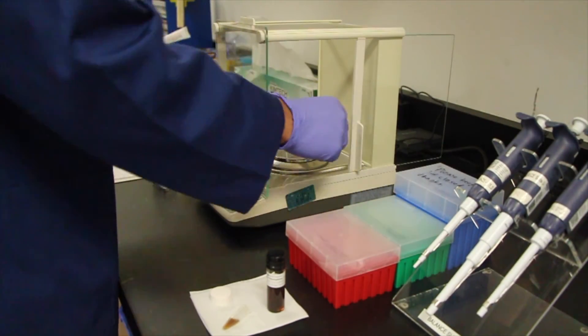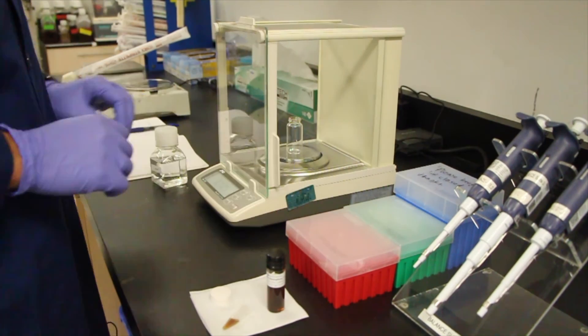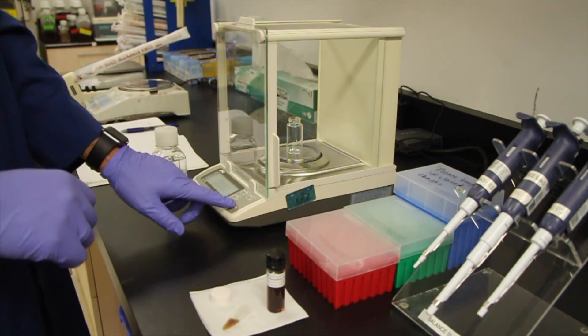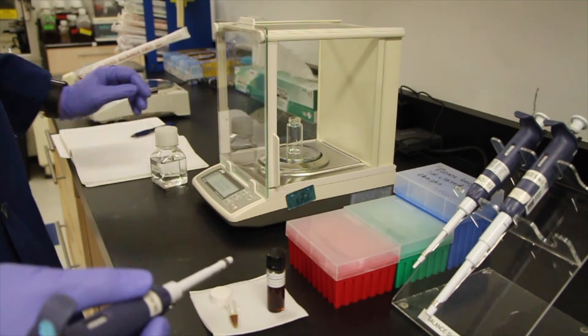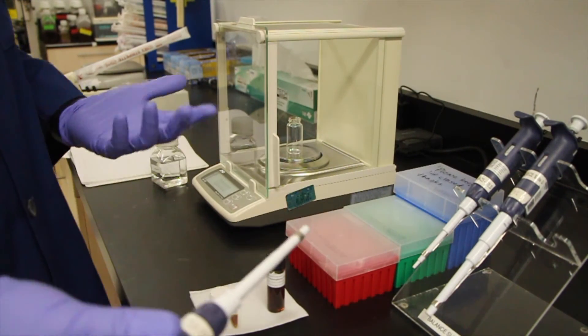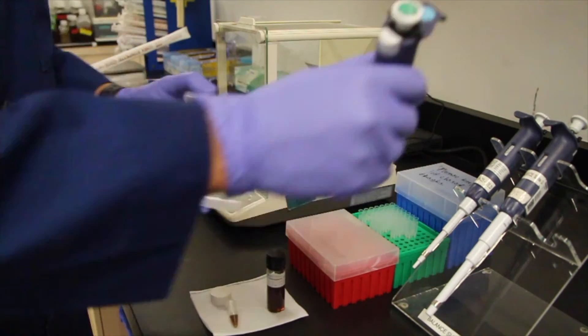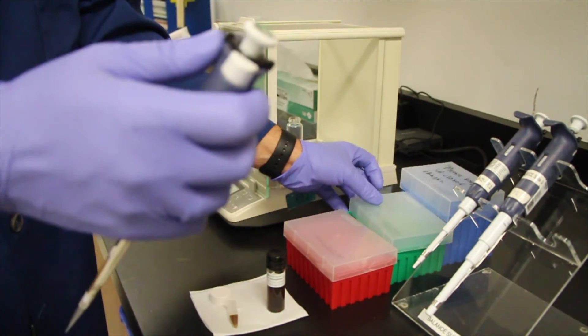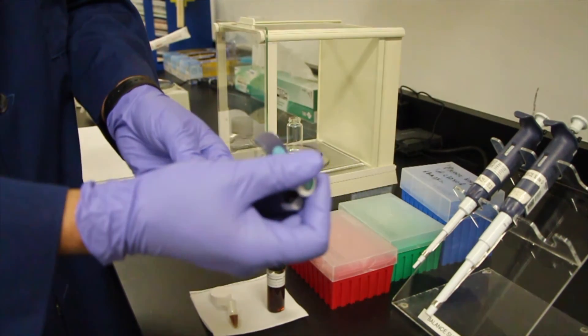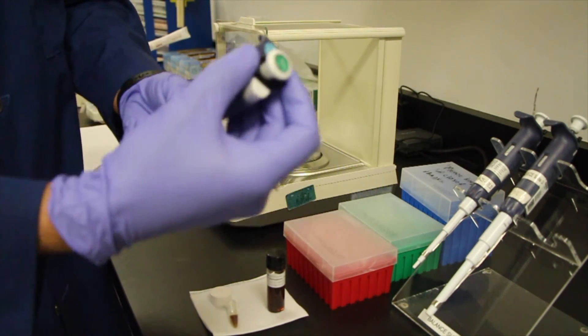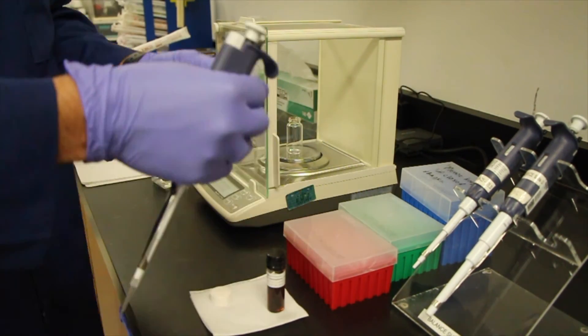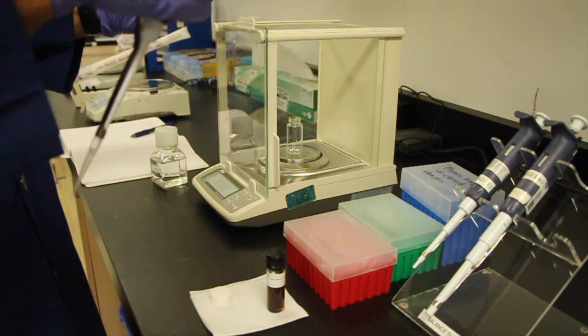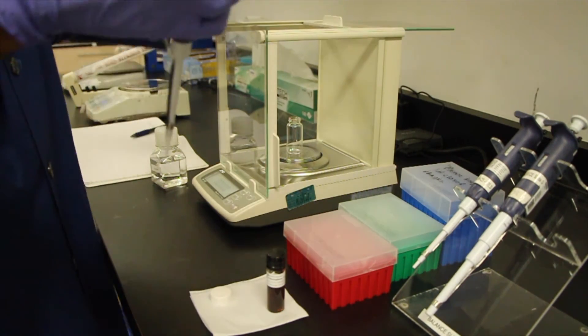We're going to start off by placing our Synth Vial inside the balance. Make sure you tare it. And I've pre-calculated my solutions because I already know the concentration of this particular material and the OD. If you didn't know you would have to prep a qualitative sample like we did in part 1 in order to approximate the OD and then you can subsequently prepare an analytical sample for the quantitative measurement.